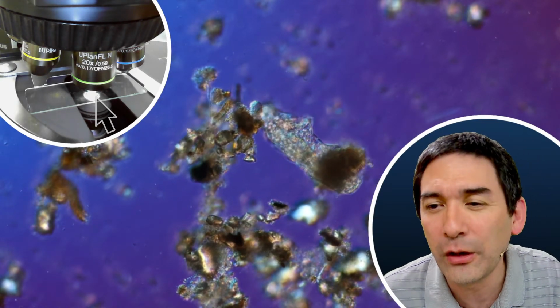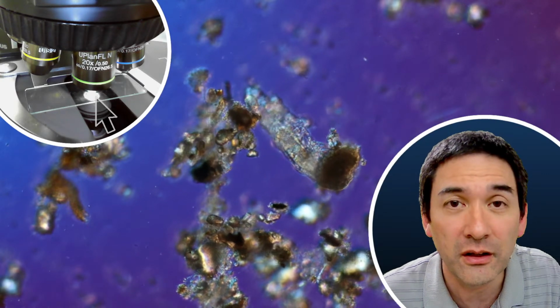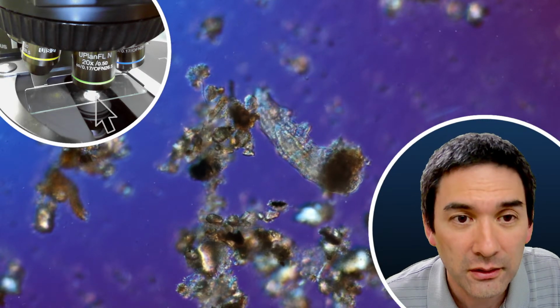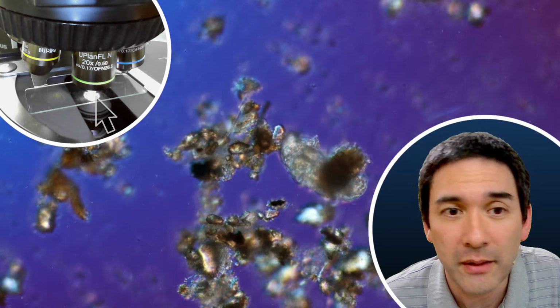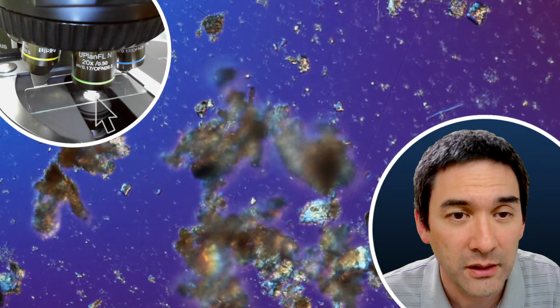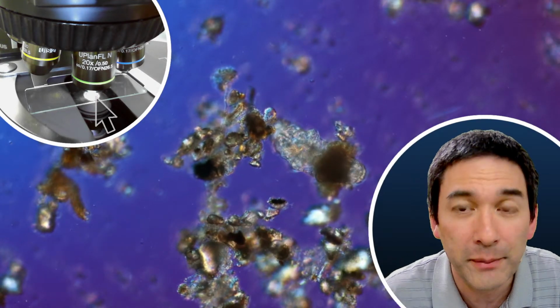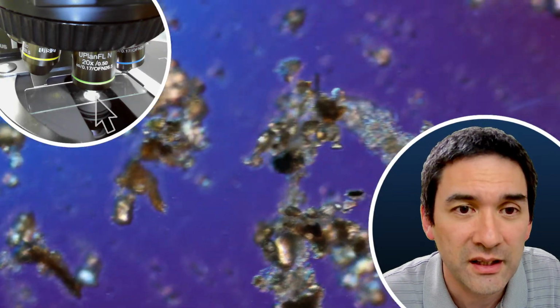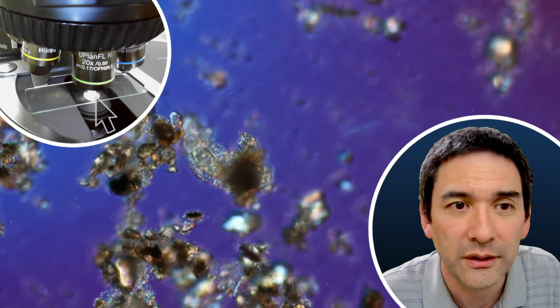Is a tardigrade a herbivore? Not necessarily. They eat all sorts, and some of them, I read, are even cannibals. After all, there are 1,300 species, so I guess they're not very selective, as long as the food is small enough to be taken in through the mouth. Bacteria, for example. That was a rotifer, kind of walking down here. No, it's gone.